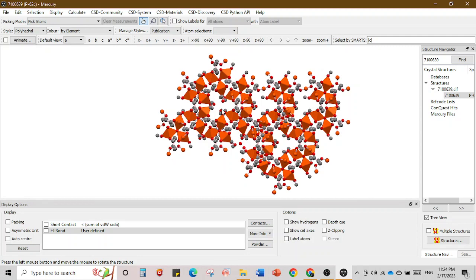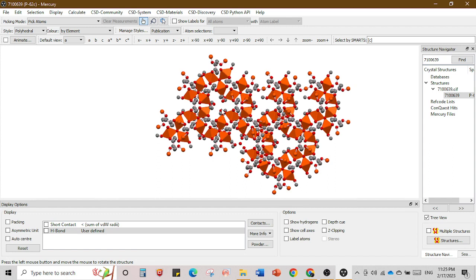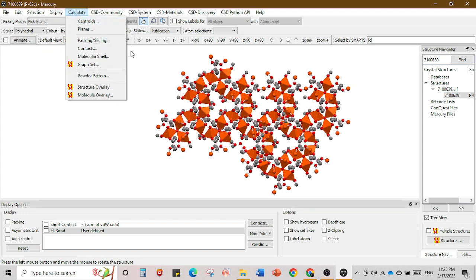A personal advice: when saving as an image, save it as JPG. JPG has good and reasonable clarity with low image size. When you save as PNG your file size keeps increasing — for example if you are writing a manuscript placing 5 or 6 crystal images, your file size becomes extraordinarily high, which is a big headache when transferring files. So saving as JPG is recommended.